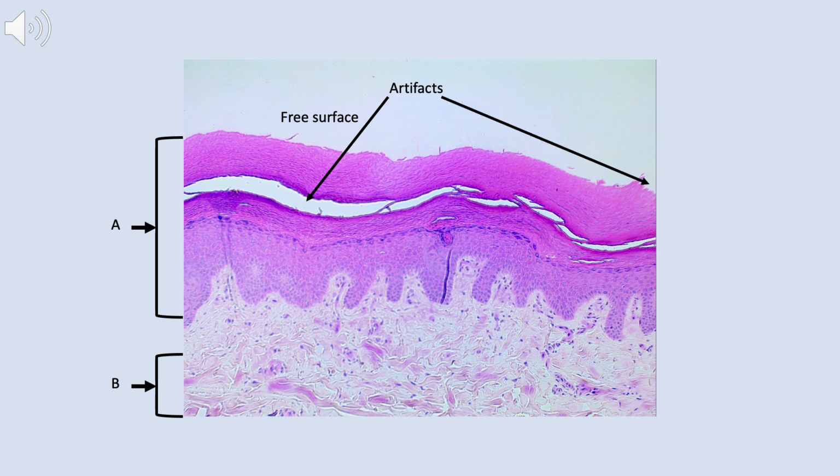You'll need to know that for the integument system, but not quite right yet. As we go down towards the lower edge of that bracket, you'll see the basement membrane, and that's a very twisty, curvy basement membrane that runs across the screen. Again, another indicator that you're looking at something from the hands or the feet. Now, point B is lighter staining, there's fewer cells, and it's deep to an epithelium, so it's most likely a connective tissue. Those big pink strands that move through there are not doing so in an organized fashion.